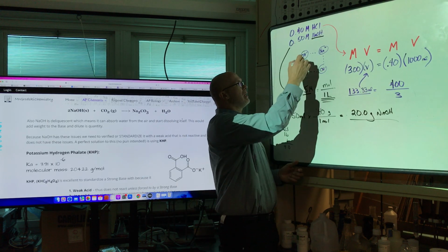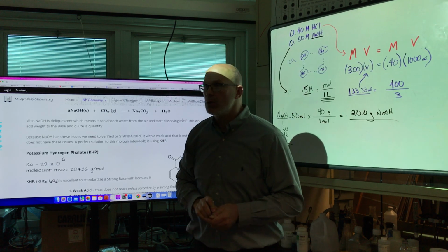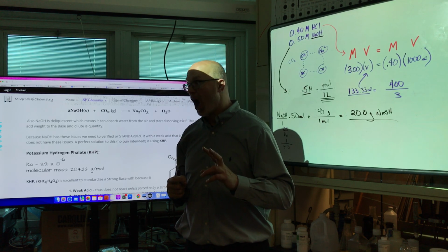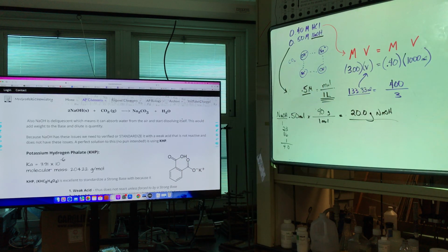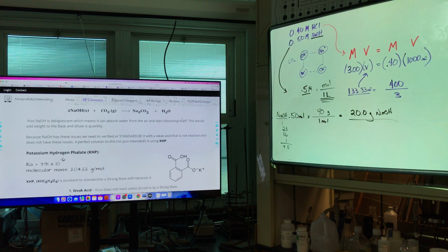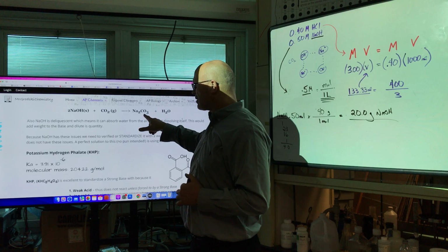So what happens is this hydroxide is going to react with CO2 when it hits it. Isn't CO2 a Lewis acid? And doesn't it want to accept a pair of electrons? And water is the base, hydroxide's the base. So as this sits in the air for a short amount of time, what happens, my friends, it becomes Na2CO3, sodium carbonate. Okay, and therefore the mass actually goes up.